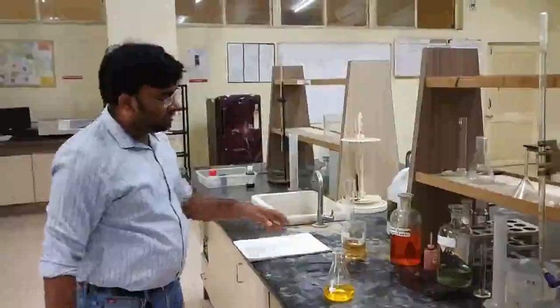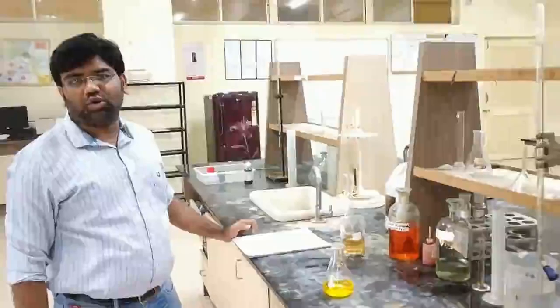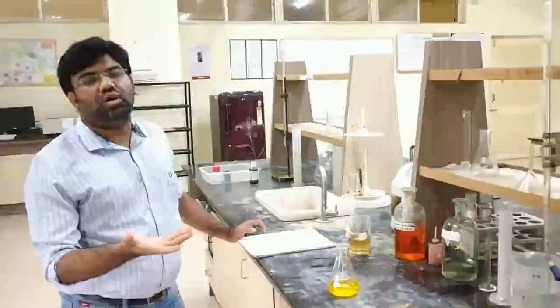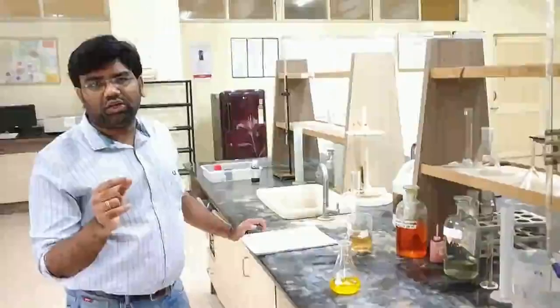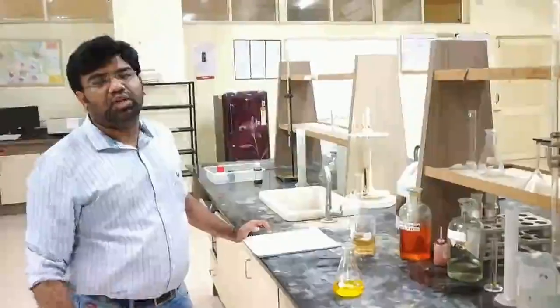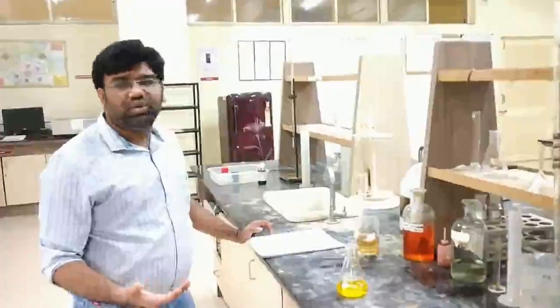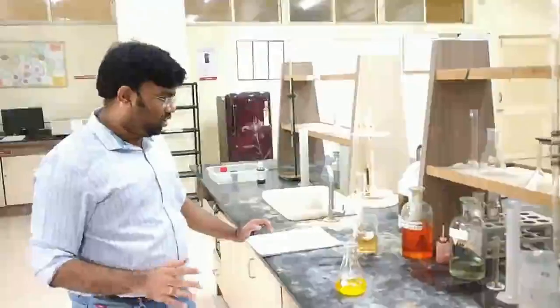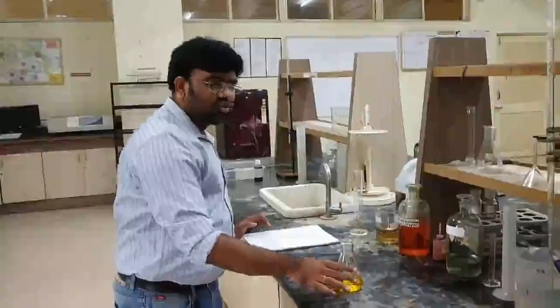We are going to require it in high quantity for the COD process, because the quantity that we have to add is 30 ml. Previously in DO or BOD experimentation, we used only 2 ml, which we measured with the small 10 ml measuring cylinder. But now the quantity is very high, that is 30 ml, and you will have to be very careful while adding this concentrated H2SO4 into this conical flask.